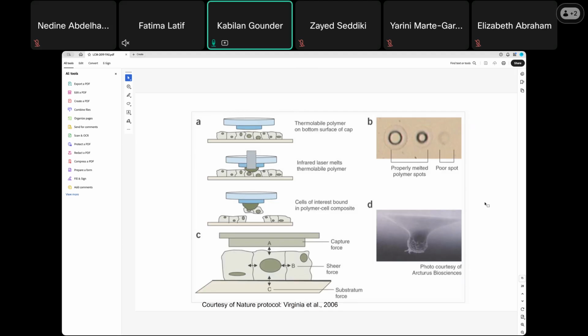So it's very simple. As for processing tissue samples, the way we regularly process samples for light microscopy and fluorescence microscopy, we can do that as well. And then you can stain it. If you isolate the cells based on structure, you can use H&E staining, or if you want to isolate cells that express a particular protein of your interest, then you can use fluorescence microscopy. So now you are going to isolate the cells. We discussed how we are going to isolate the cells.